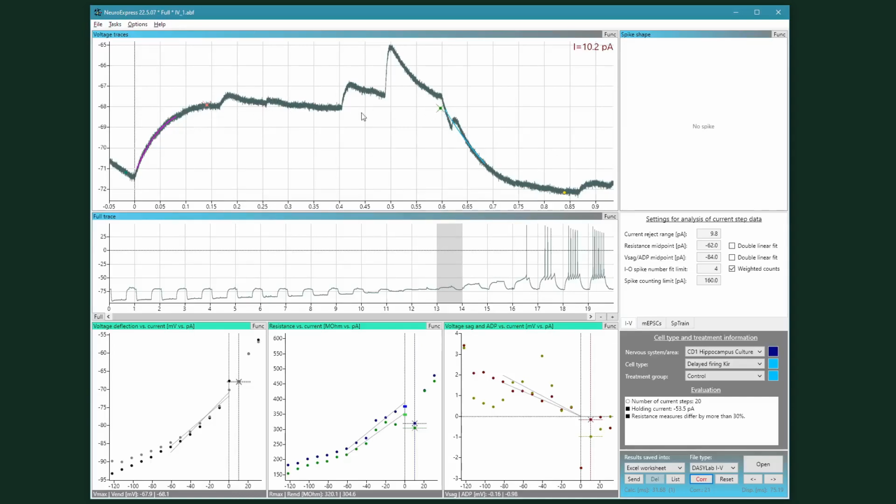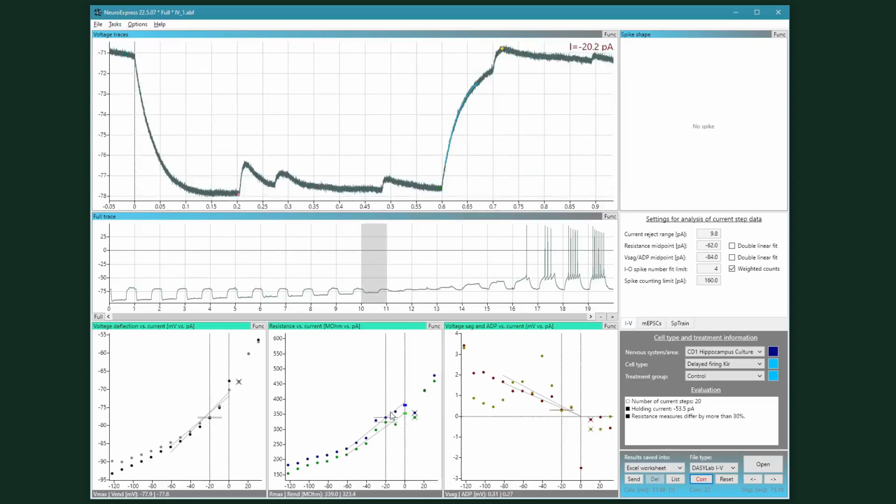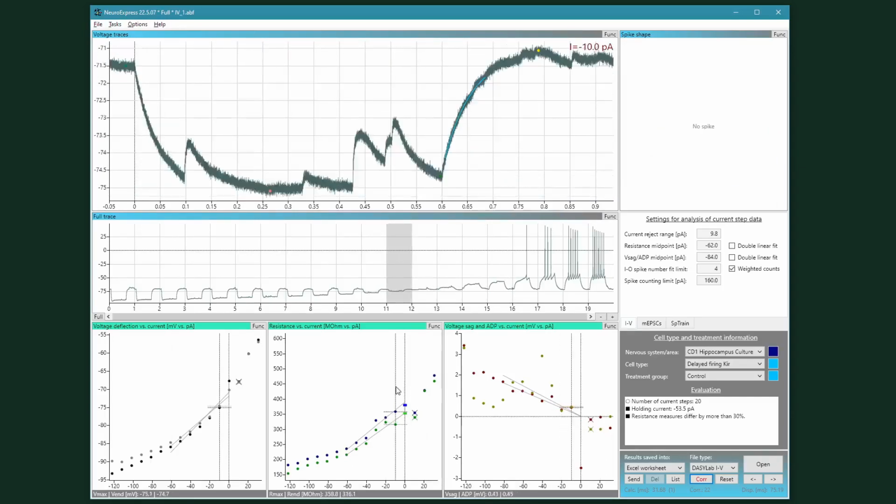In addition, the membrane potential was also a little bit shaky or strange here, and I am pretty sure that there was an additional EPSP that was just decaying before the current step started. So here we have an EPSP that did not fully decay before the step. You can also move this point up and down, and then of course the associated membrane resistance value will be recalculated.